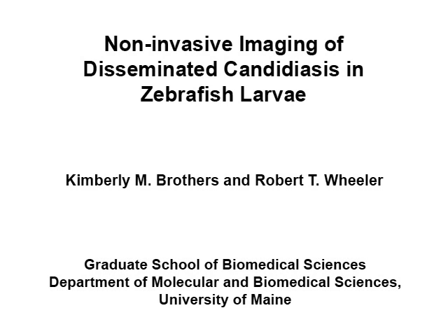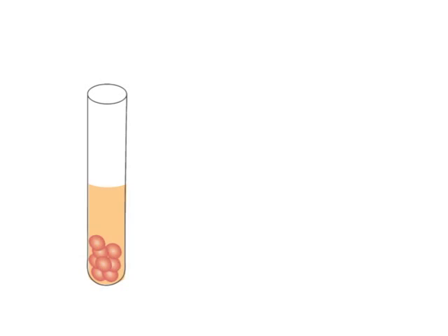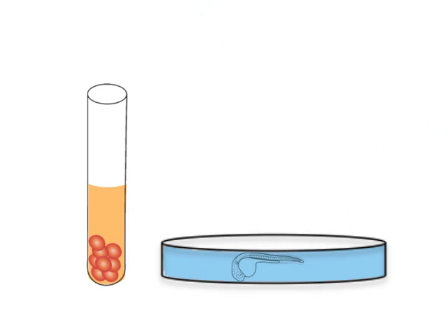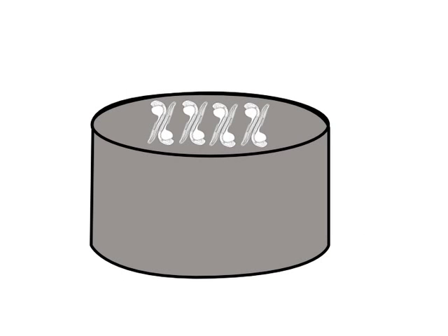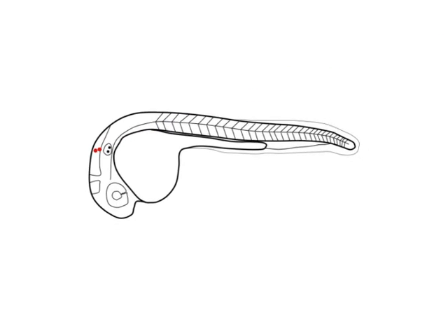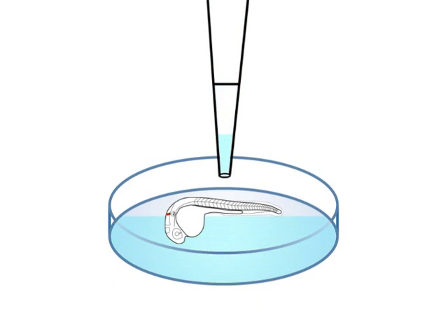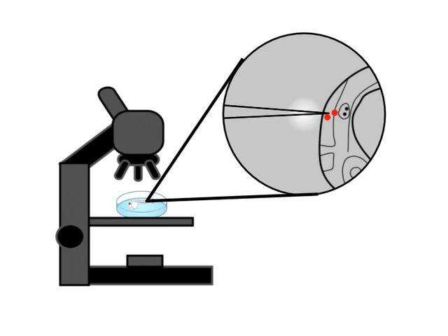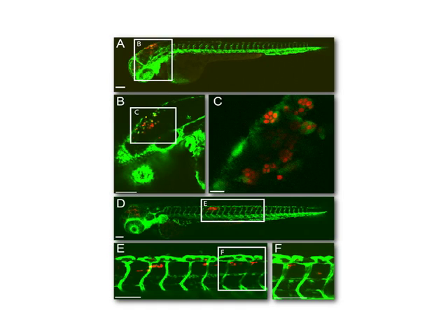The overall goal of this procedure is to demonstrate techniques for infecting zebrafish larvae using the fungal pathogen Candida albicans. First, a fluorescent fungal culture is prepared and fish embryos are de-chorionated. Next, the fish are lined up on an agarose injection dish. Candida albicans is microinjected through the ear of each fish into the hindbrain ventricle. Fish are then embedded in low-melt agarose and visualized by epifluorescence microscopy. Ultimately, this method can be used to non-invasively image the host-pathogen interaction in the complex environment of the host, rather than the simplified system of the petri dish.